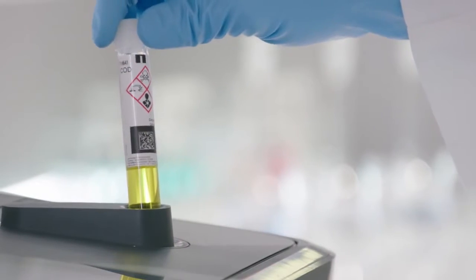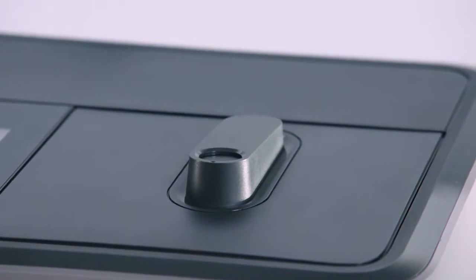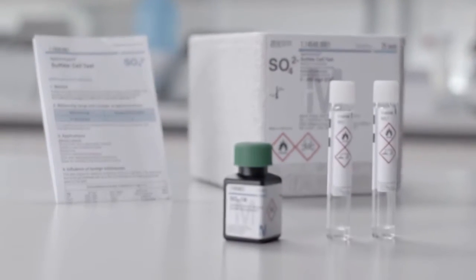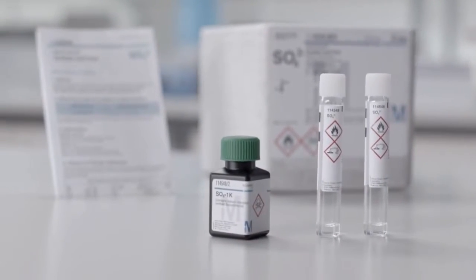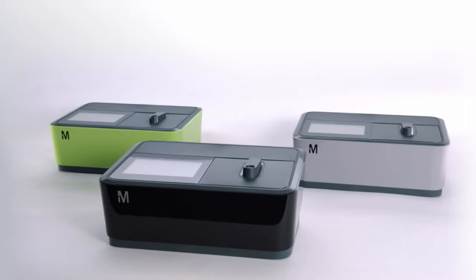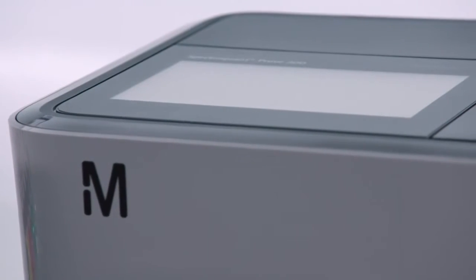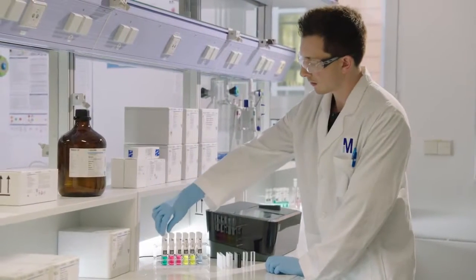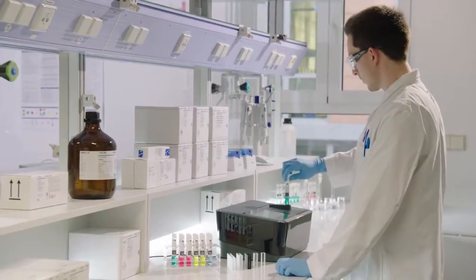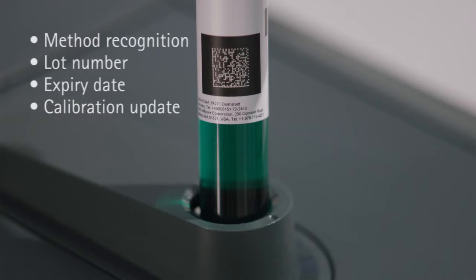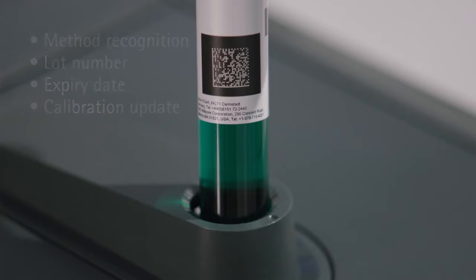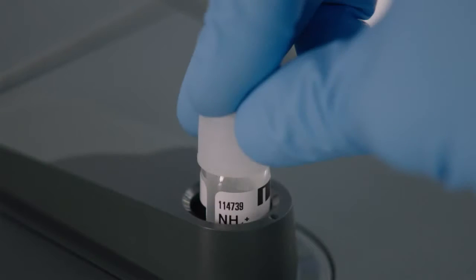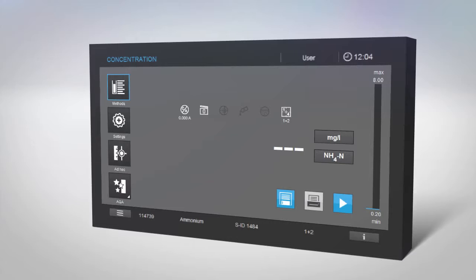If you use our SpectraQuant cell test kits, you can insert the round cell directly into the cell port. These kits contain virtually all reagents necessary for the analysis. When used with SpectraQuant Prove, the system automatically selects the correct analysis method in the instrument. All important information regarding lot number, method selection, expiry date, and calibration updates are provided on our new LiveID barcode. Match the white line on the label with the dot on the cell port. The measurement will start automatically.